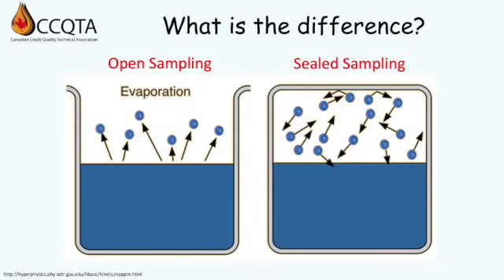We saw this illustration in episode 1 in relation to open or closed systems such as tanks. The same applies to sampling. Sampling into an open container exposes the sample, in this case crude oil, to atmospheric pressure and ambient temperature. The impact of that can be from negligible to significant depending on the composition of the fluid being sampled.